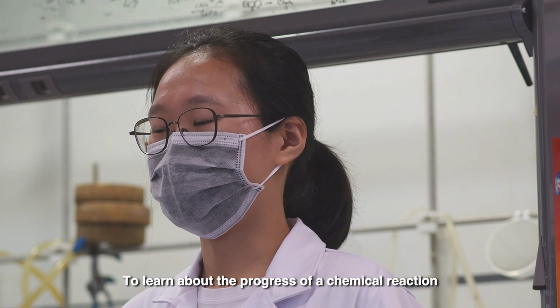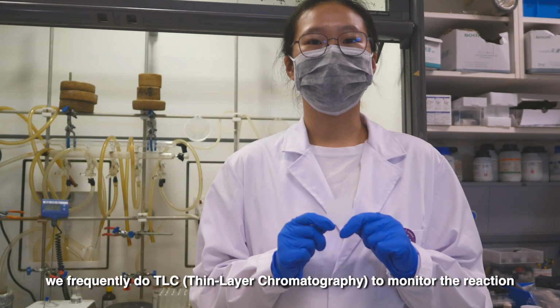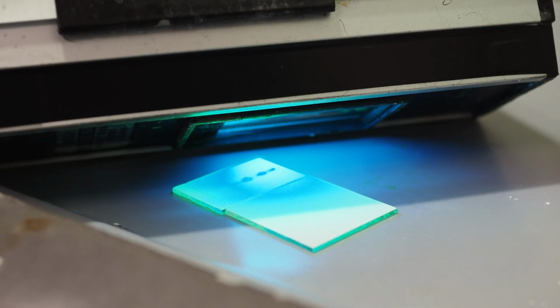To learn about the progress of a chemical reaction, we frequently do TLC to monitor the reaction. We do thin layer chromatography using these glass plates that are covered with silica gel.